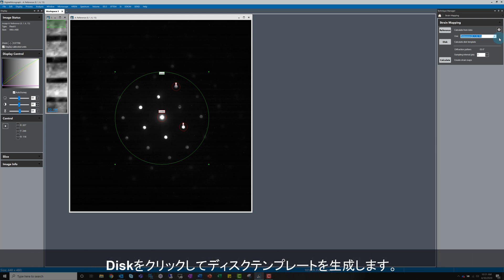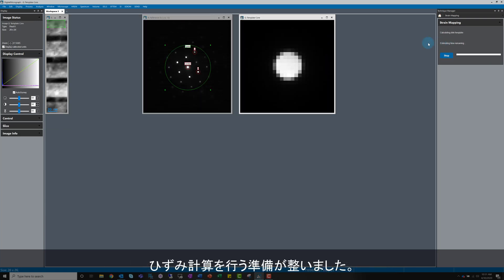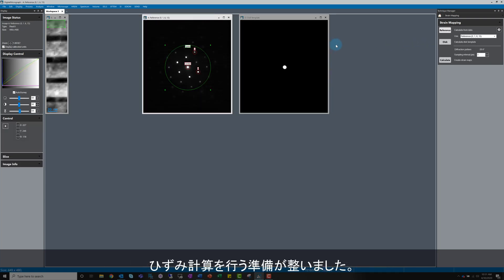Fortunately there isn't much to do here. Just click on disk. The software will use up to 2,000 diffraction patterns in the data set and then outputs an average disk template. Now we have everything we need for the strain calculation, but there are a few important points to cover before moving on.